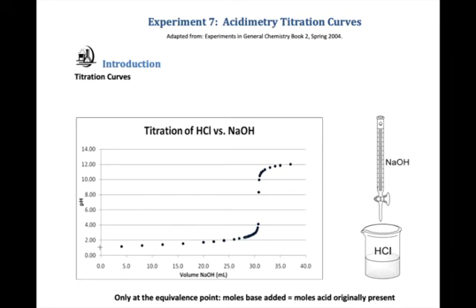And notice that the starting pH is something around 1. And that would mean for our strong acid that the concentration has to be quite close to 0.1 molar. And that would be, for example, the concentration that we want to know more accurately.